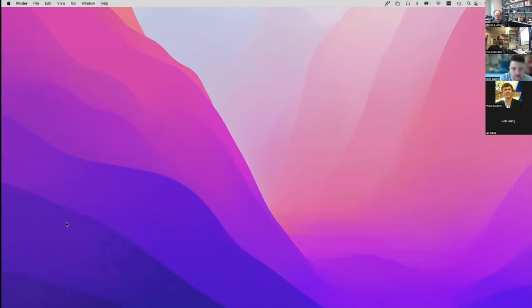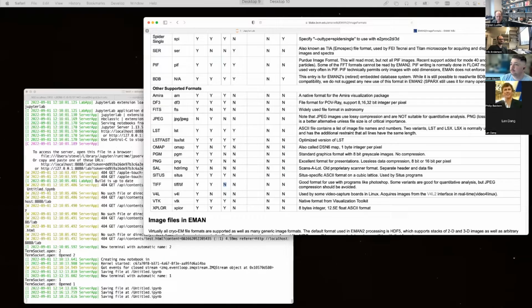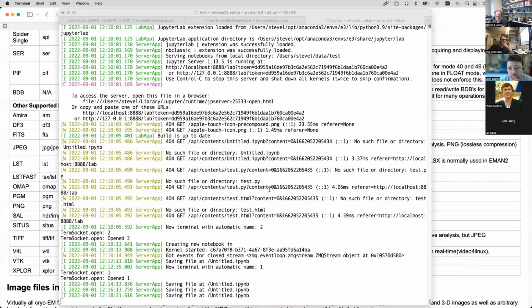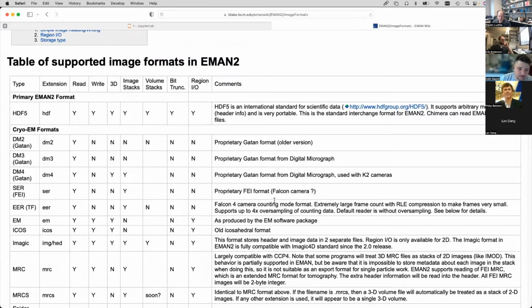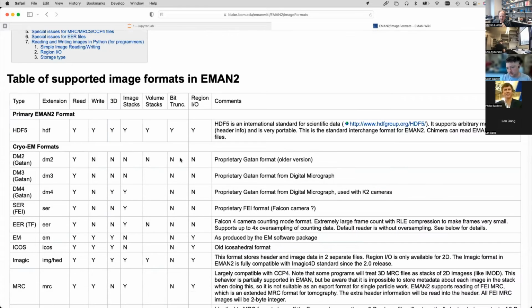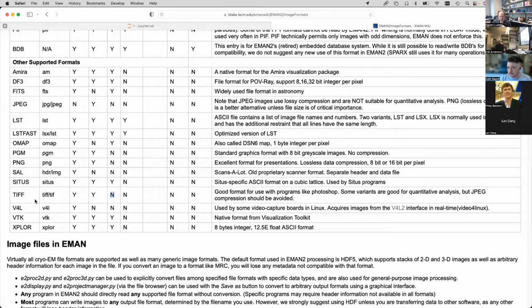Oh, okay. So one of the issues is getting the people who actually do the updates to update the documentation, which unfortunately doesn't always happen. Let me just take a look. I'm sure I have. Oh, actually, on this machine, I may not have any TIFF files here. Yeah, give it a try. Our intention is to actually support writing to TIFF stacks as well, but we haven't gotten around to doing that.